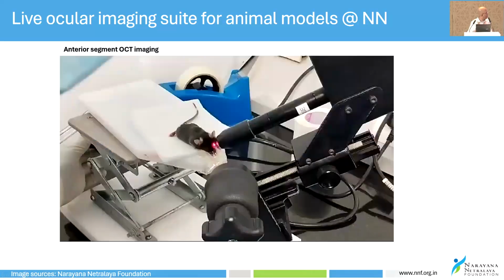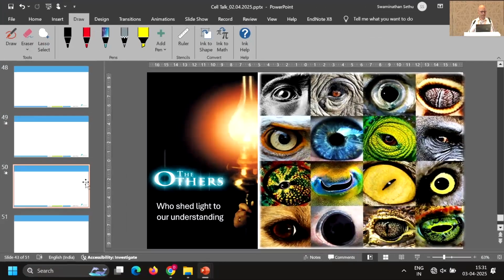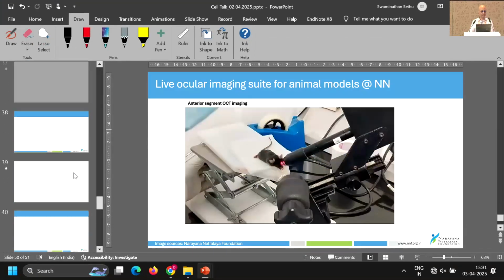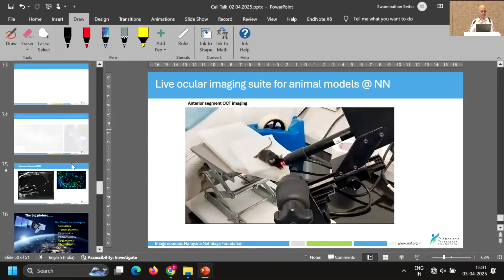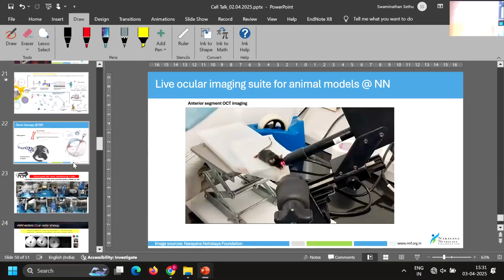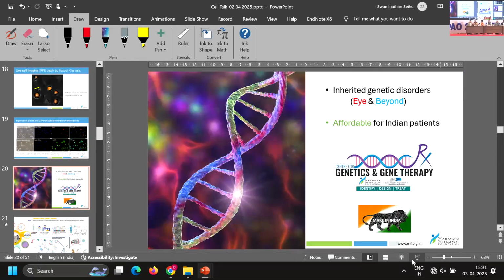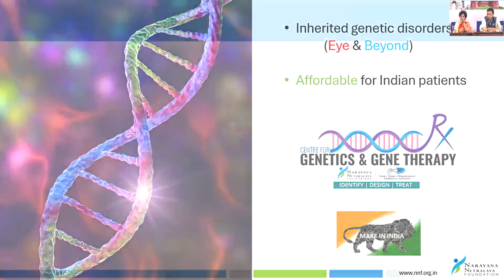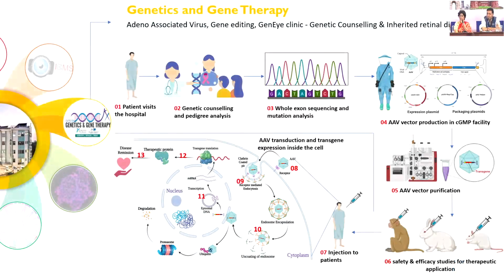So we'll go to the gene therapy unit. The talk is also going to be followed by that. The gene therapy units have very strict criteria in terms of who can enter, because of the challenges, as we work on gene modification.